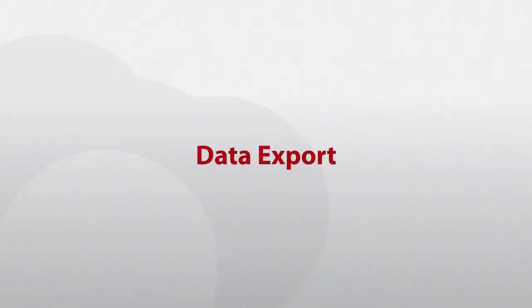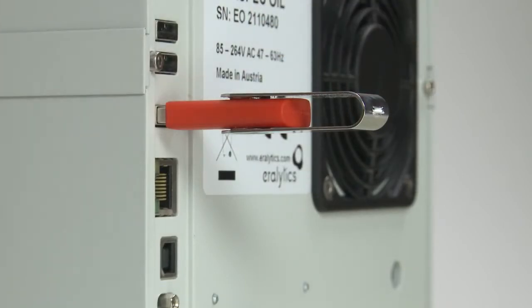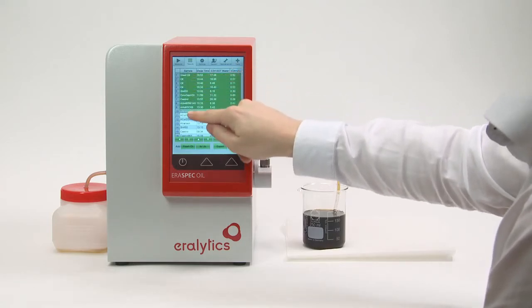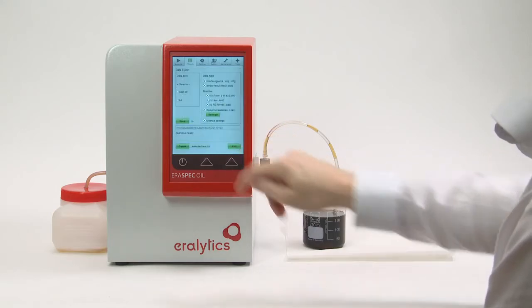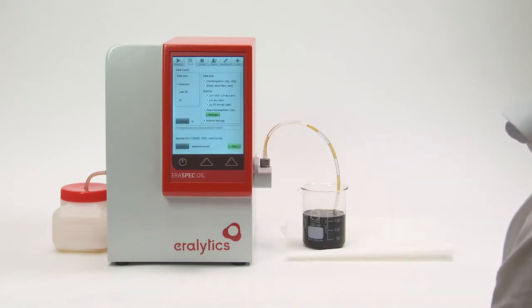Data export. The results from the measurement can be exported to a USB stick. Click on the Results tab to see the list of stored spectra. Mark the spectra that shall be exported and click Export. By default, all ASTM, JOAP and DIN standards, as well as the correlated parameters, will be exported to the results spreadsheet. Press Save to save the results to the USB stick.